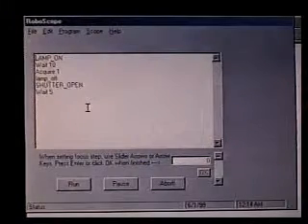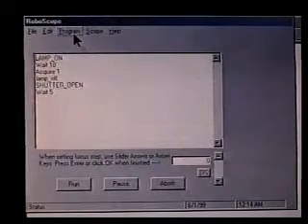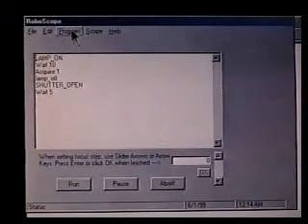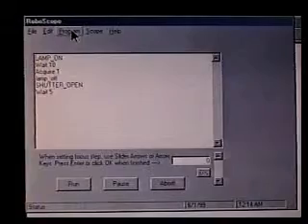Okay. Now we're going to acquire the ultraviolet illuminated image.